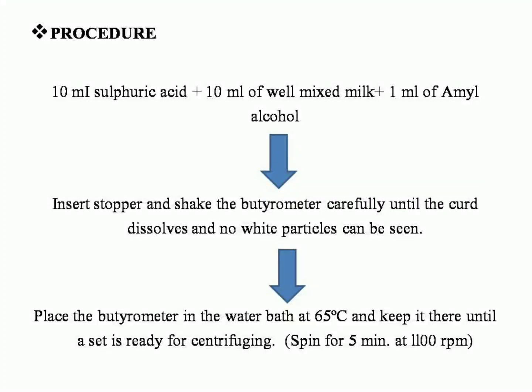The next test is the Gerber Butterfat Test. For this procedure you need a butyrometer, 10 ml of milk, 10 ml of sulfuric acid, and 1 ml of amyl alcohol. Shake the mixture.